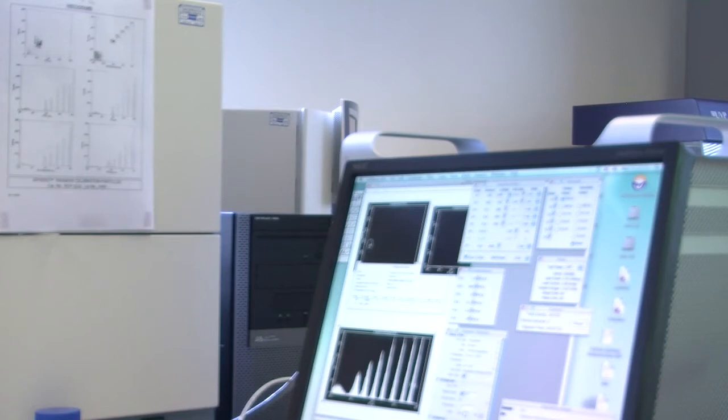So, I will do that for you. What I'll do is take your data files away and send you back a sheet with your forward and side scatter, size and granularity, your fluorescence histograms with the quadrants showing percentages, and histograms like this of all of your data, showing the median, so the amount of fluorescence there is. And we just make the analysis of that graph.